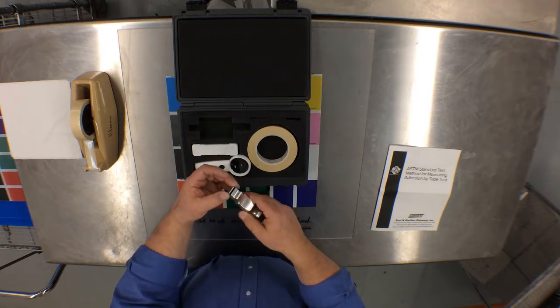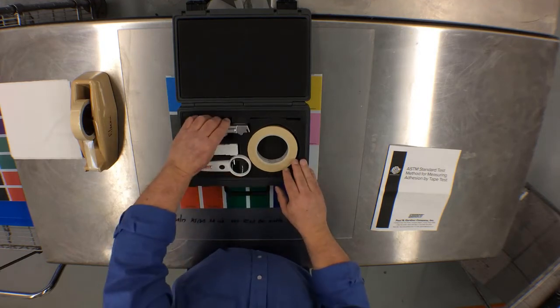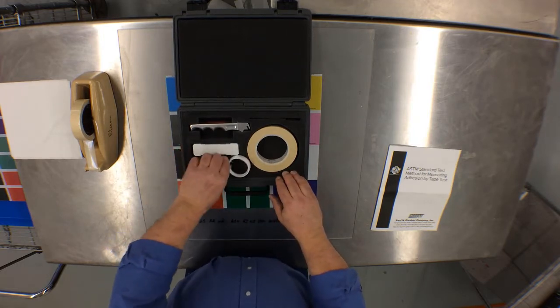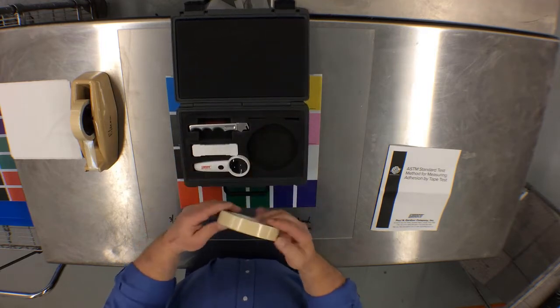The kit also includes a hex wrench for changing blades, a flaking or cleaning brush, an LED handheld magnifying glass, and a standard tape from EndoTape.